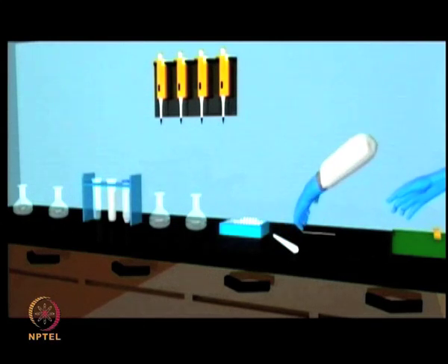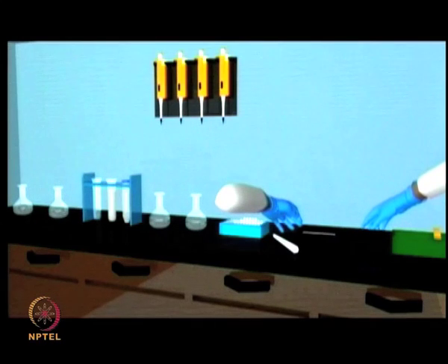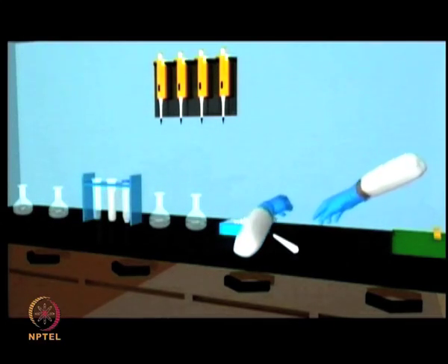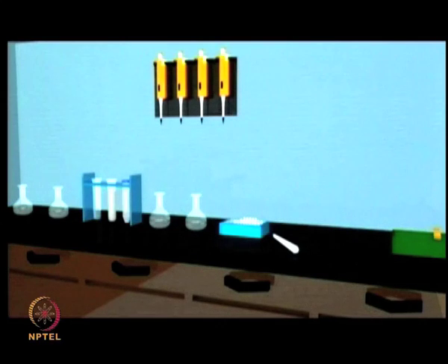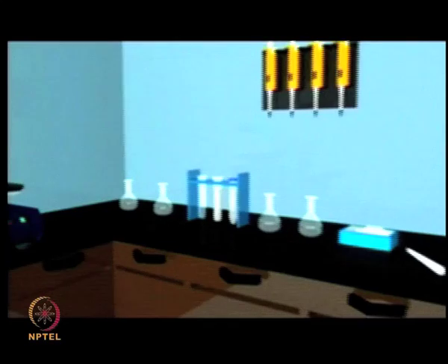One can typically use a pipette tip box or a small box with approximately 30 ml or 50 ml of the blocking solution. Dip the microarray slides inside the solution. Once the blocking is completed, you can remove the slide and tap it against a paper towel to remove the excess milk.